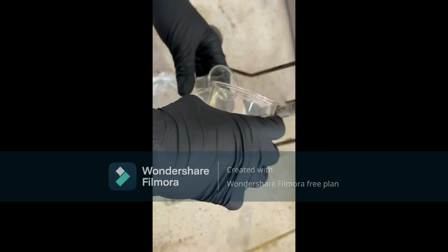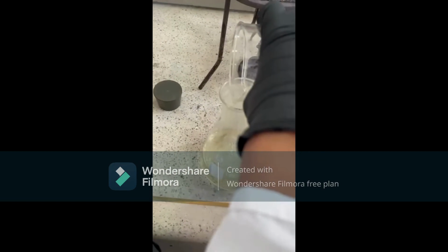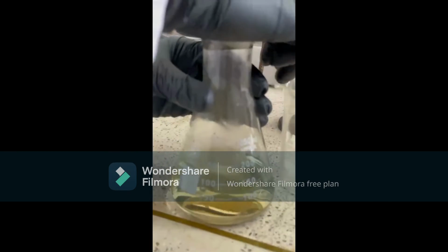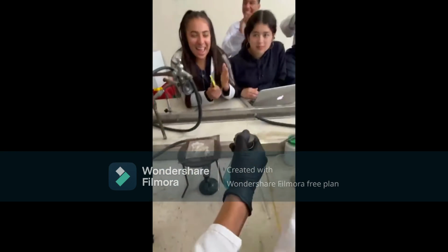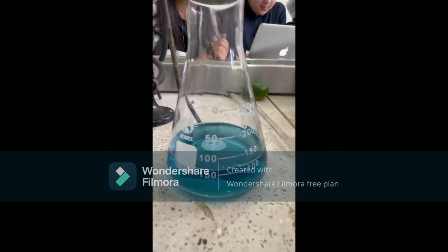As expected, as we mentioned in the fundament, in the first try, when the Erlenmeyer flask was shaken, the substance was oxidized, showing a light blue color, meaning that was the methylene blue. And then after 3, 4, maximum 5 seconds, we can notice how that oxidation was reduced to leucomethylene blue. And when we repeated it the second time, things were different.